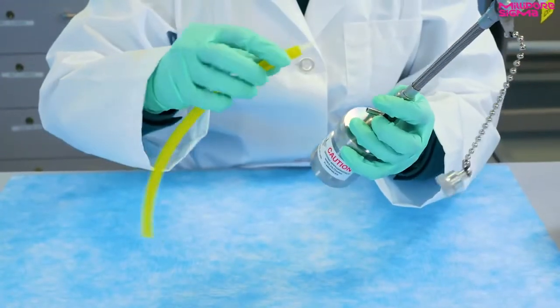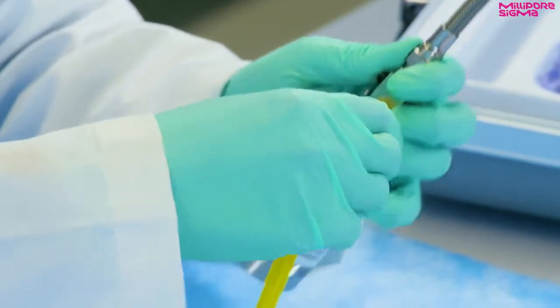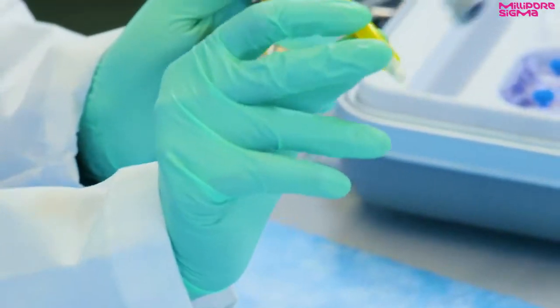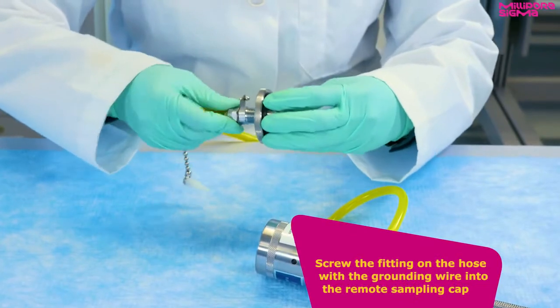Connect the bypass hose from the three-way inlet valve into either hole on the side of the sampler base. Screw the fitting on the hose with the grounding wire into the remote sampling cap.